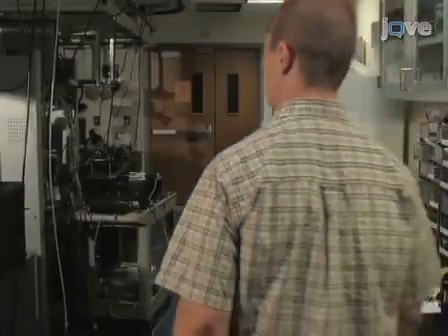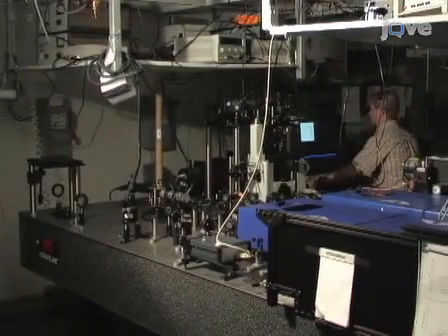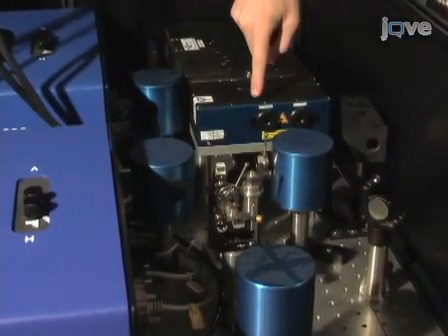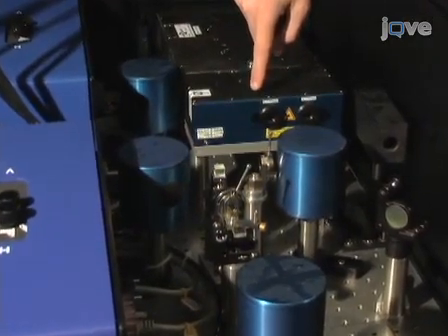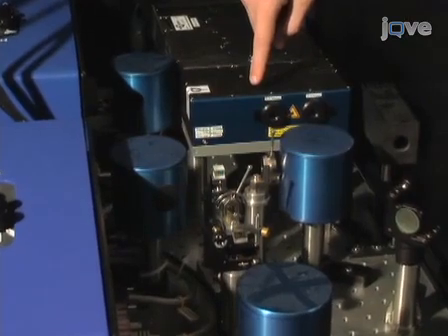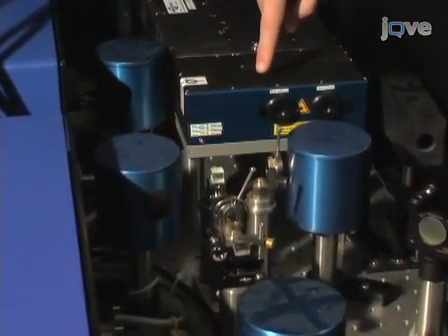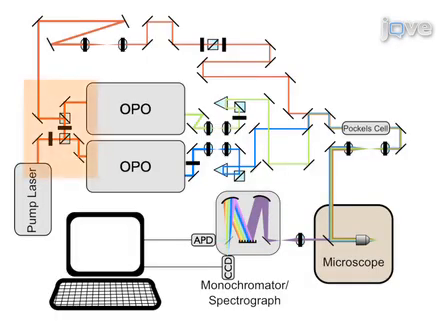In order to generate CARS and DR CARS signals simultaneously, three tunable and synchronized short pulse laser sources are required. To obtain these synchronized pulses, start with a single short pulsed laser with an output power of 10 watts, a fixed wavelength of 1064 nanometers, a fixed pulse length of 7 picoseconds, and a fixed repetition rate of 76 megahertz. Using a series of half-wave plates and polarizing beam splitter cubes, the beam is split into three parts.